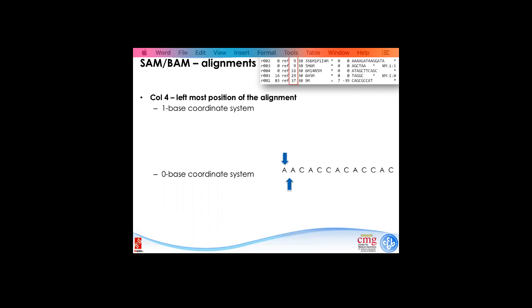Another couple of concepts I thought are important, so I want to mention them. For this one, it's very simple. It's a 7, 9, or whatever. This is basically the genomic location of where the read starts in the reference genome. Nothing fancy, but they made it really fancy now, because this can be very difficult to interpret, in that there are 2 different systems of this.